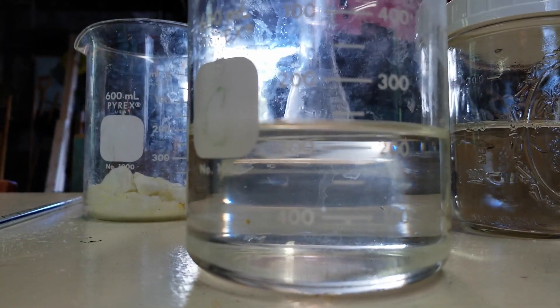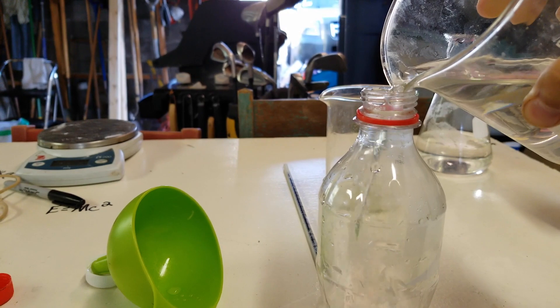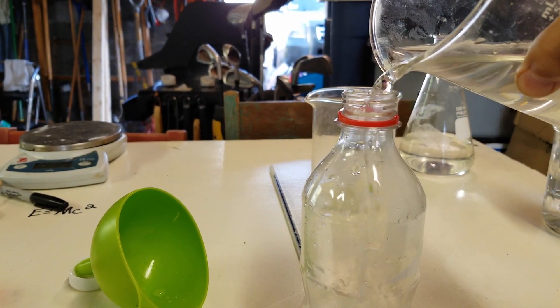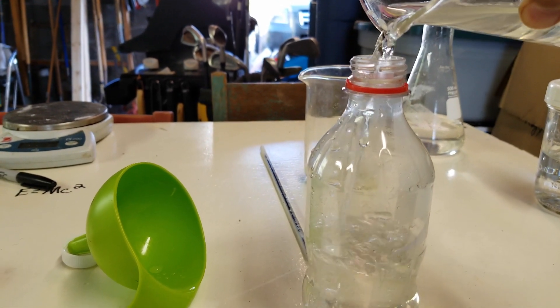And you can see here that I got around 230 milliliters of concentrated HCl. I decided to store it in this plastic Coke bottle, which probably isn't the best idea, but I made sure to label it very clearly.